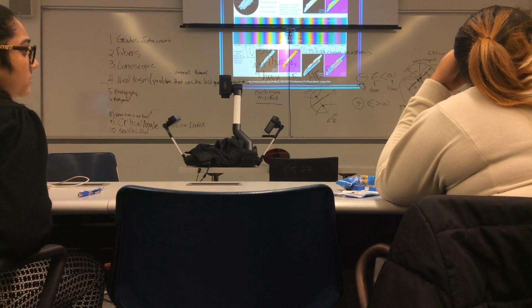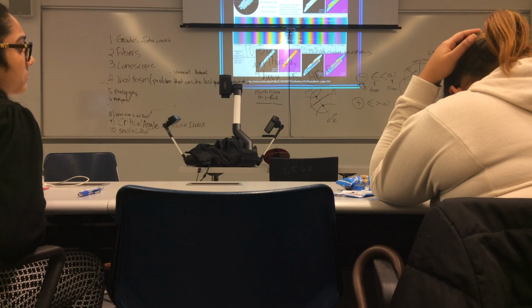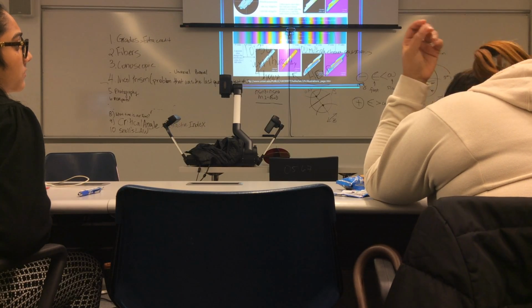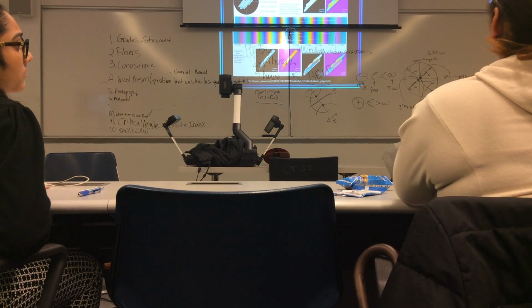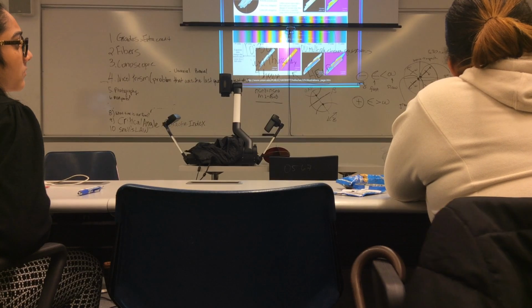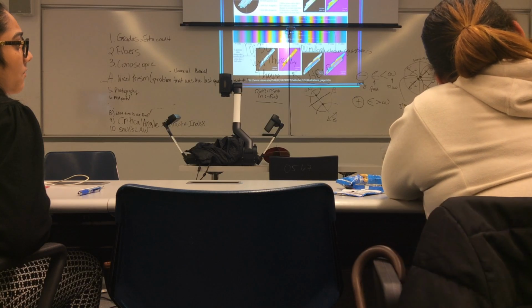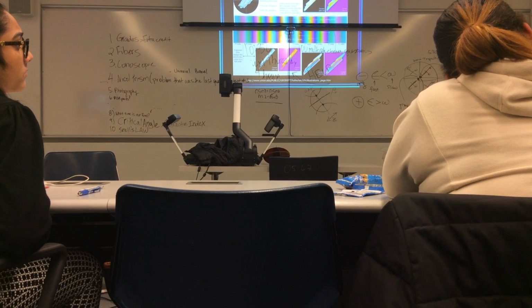Okay, and you'll notice that that also happens to be the direction that's perpendicular to the trace of the optic axial plane. So that'll always be the case if you have a centered interference figure where the acute bisectrix is aligned with the light path of the microscope. Not the case if you've got it differently. And in fact, there are more complicated things, but let's just start with those basics to begin with.